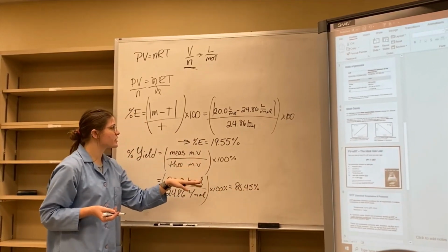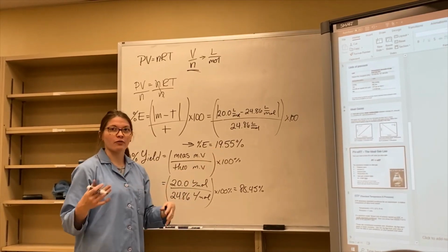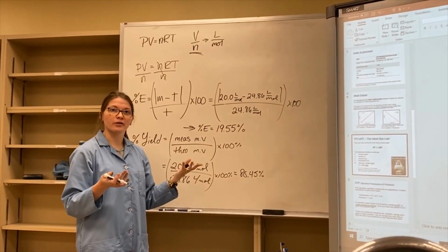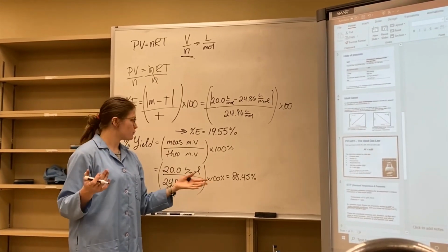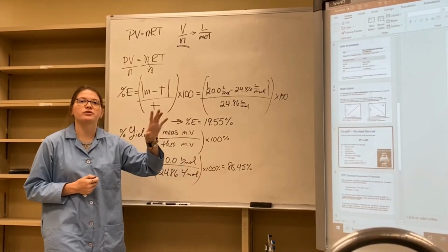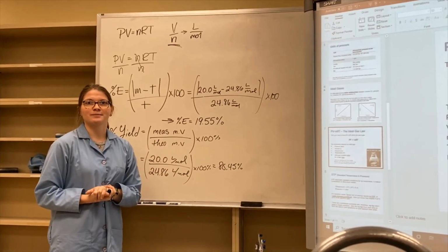When you're analyzing this, remember percent error, we want lower, and anything we get, we do have to account for. We did note some things that could have been errors in our lab, and then for our percent yield, the higher the better. So you want to make 100% of your product. We made about 80%. So sort of great, sort of good. But that's going to be our calculation. Make sure you check the documents online, and if you have any questions, reach out to your TAs.